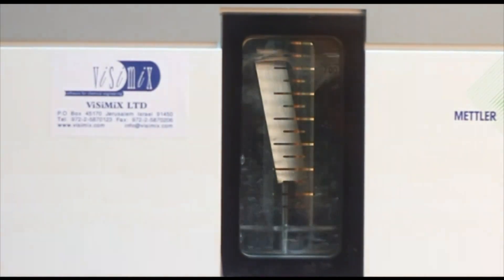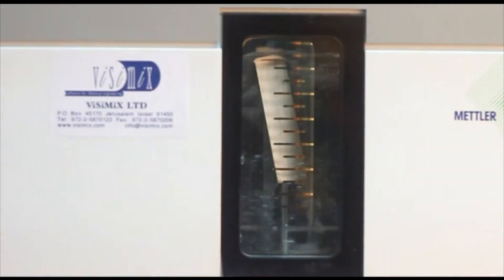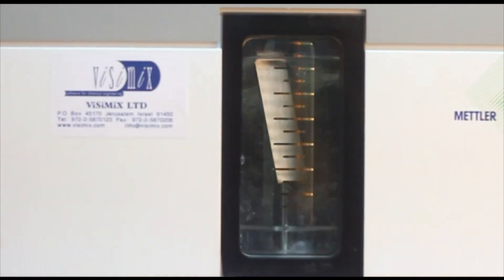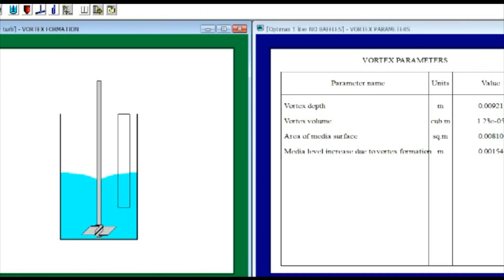It is possible to avoid this problem and increase mass transfer in the system by introducing baffles to the reactor. As you can see, the vortex is practically absent in this situation.